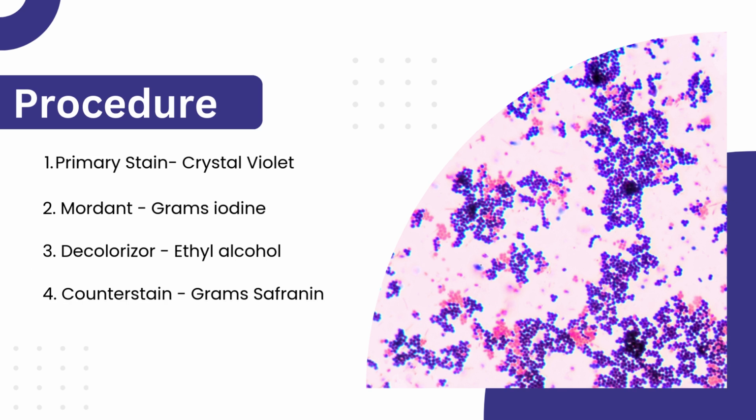As I demonstrate each step, I'll explain not just what to do, but also what is happening at the microscopic level inside the bacterial cells, so you can understand why each step matters and how the differences in the cell wall structure affect the final results.